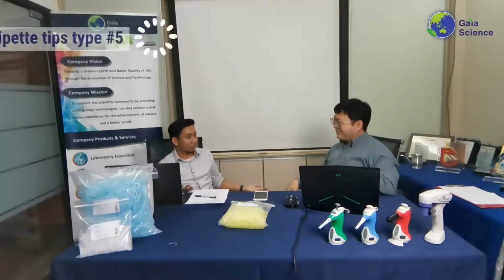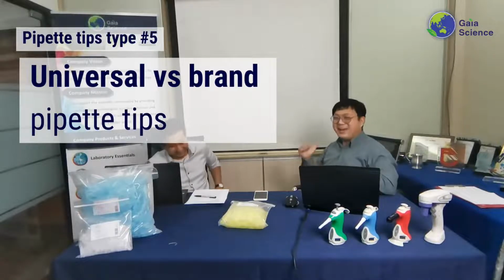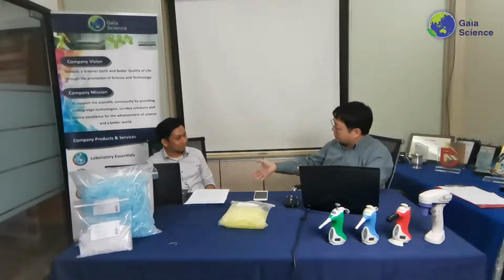Universal and brand-specific pipette tips. Okay, I'll tell you in two words only: I wish all brands were equal, but unfortunately, no. Okay, that's the true answer actually. So when you talk about pipette tips, I would say there are two categories. Let's go back to different brands. Unfortunately, they are all not equal.